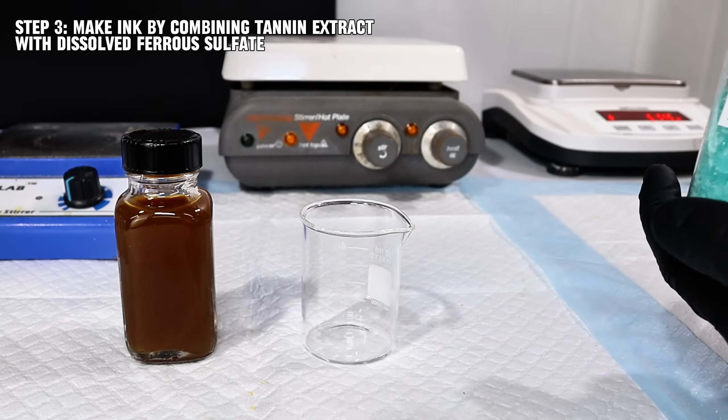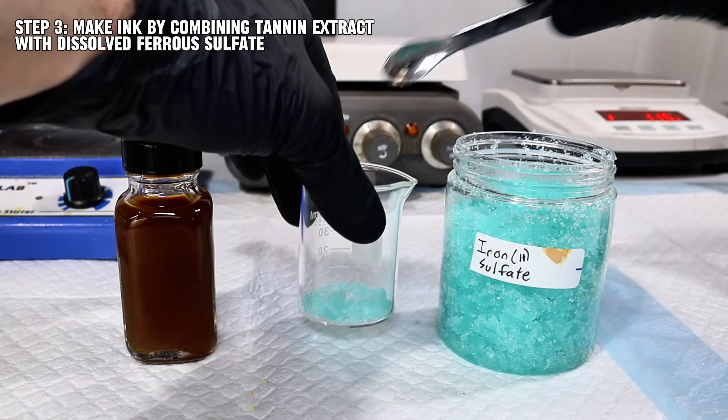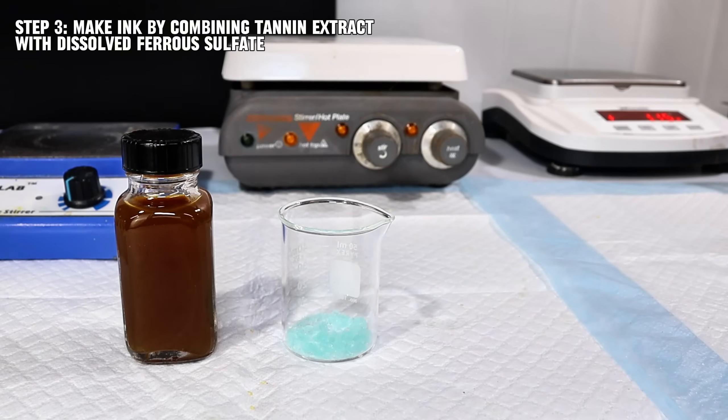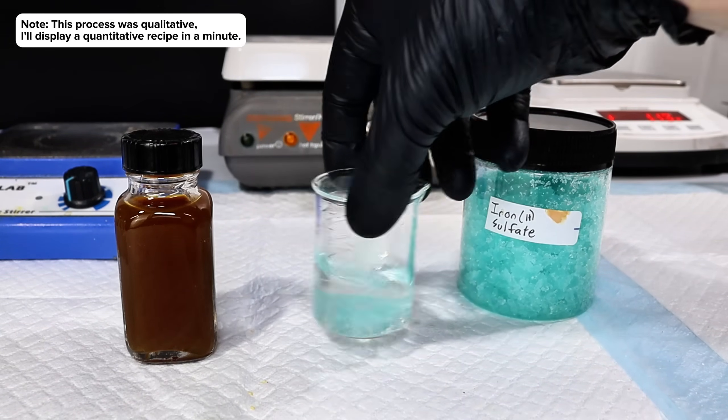Now that I had my two ingredients, it was time for the exciting part: combining the tannins and the iron sulfate. To do this, I first took a few crystals of my iron 2 sulfate and dissolved them in a small amount of distilled water.